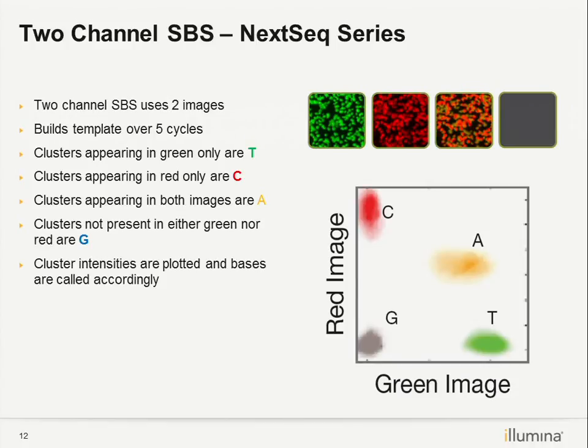If you're using Illumina's indexes, there is only 1 index that starts with GG. But I know some of you might be using third-party kits. So before that, please review your kit indexes to avoid indexes starting with GG. Right, I have some users tell me that they tried it and it works, but officially it's not recommended to use an index with GG.